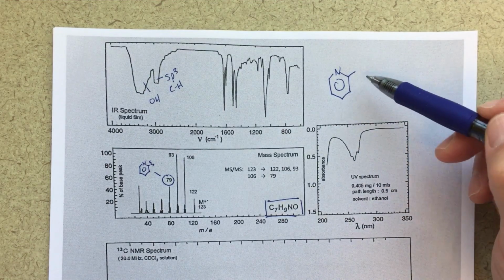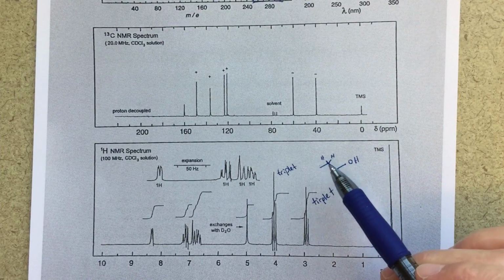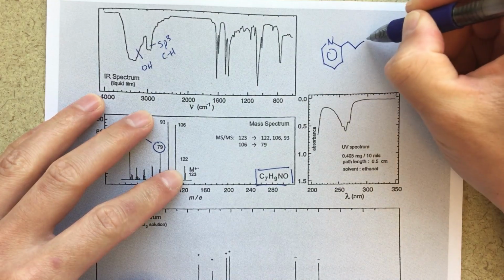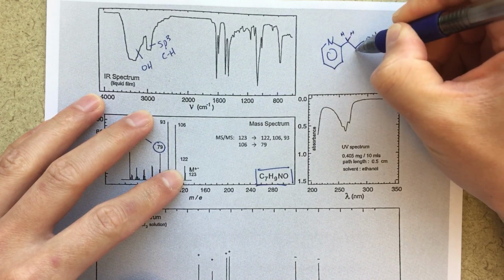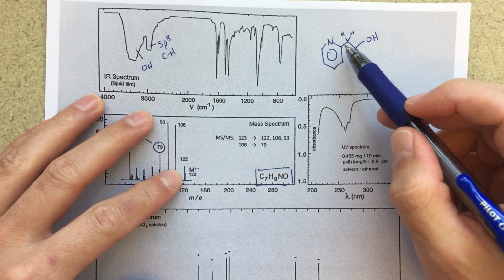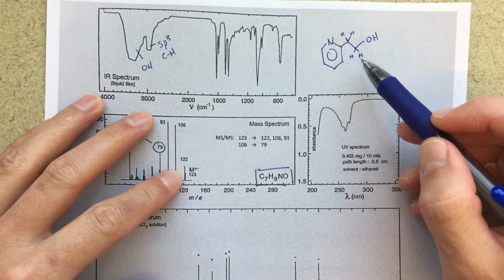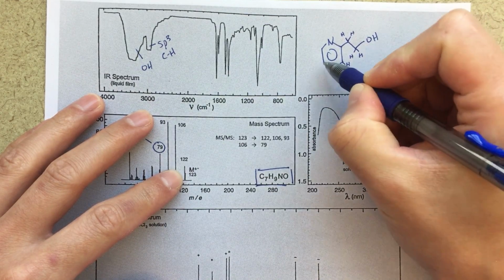Now, trying to sort of put this together with what I figured out down here, I could just throw this on over here. And now I would have my two high triplets. So then since this is bonded to the ring, there's no hydrogen here, so I would get no more coupling. So then this would be a 2 high triplet, this would be a 2 high triplet. So this would be a good first guess.